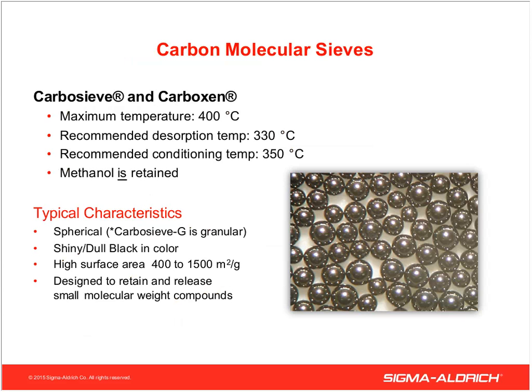So then we move on to the carbon molecular sieves. In most applications, a weaker bed of a porous polymer or a graphitized carbon black should be placed in front of them to keep the heavier compounds from becoming irreversibly adsorbed. The only time a carbon molecular sieve should be used by itself is if we're confident that our sample doesn't contain compounds with boiling points greater than benzene.